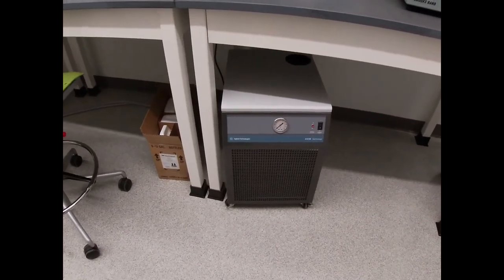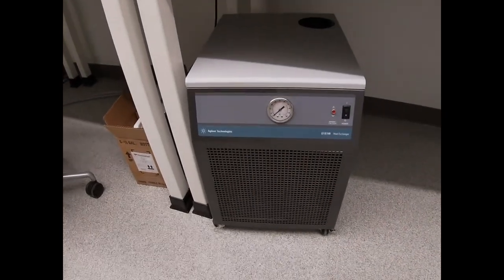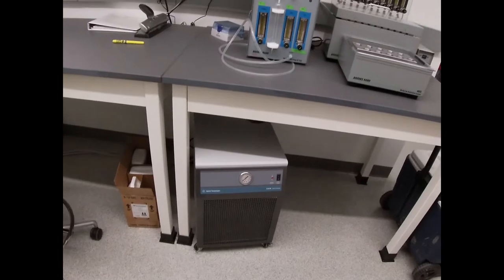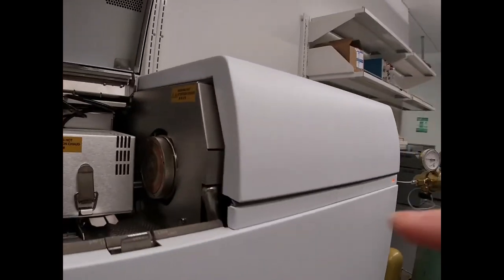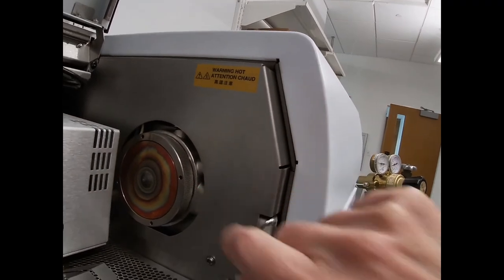And we have a heat exchanger or a chiller. It serves to actually cool this plate right here to keep it from getting too hot while we're actually running the plasma.